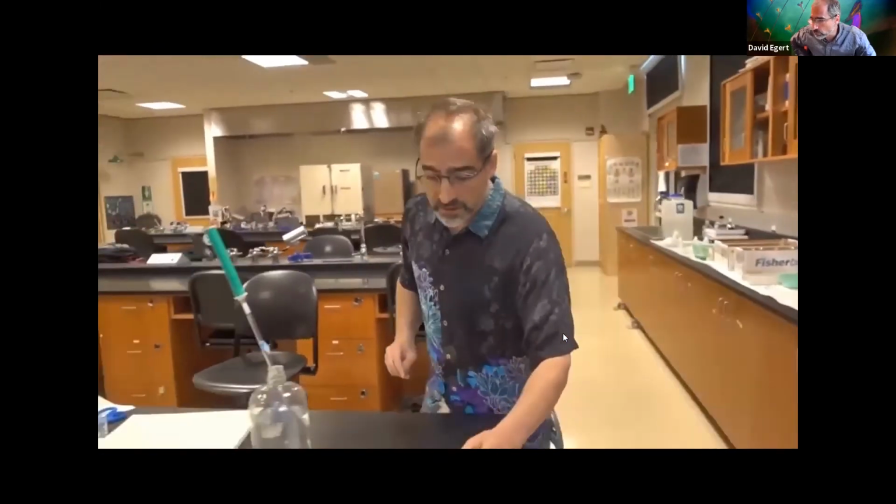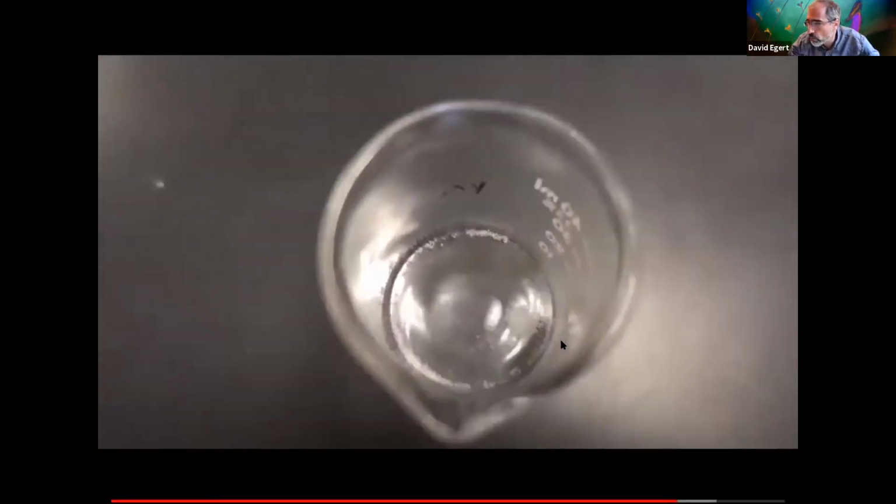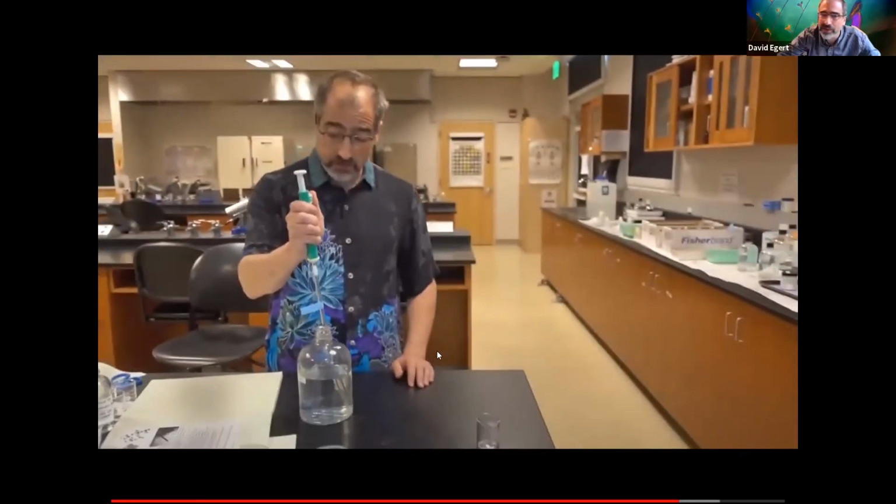And again, you can take a look and see there are little granulated glucose crystals in there, which again, you would record in your lab notebook. That was really fast, but hopefully you can see. And glucose is not sucrose. The sugar you're putting into your coffee, that's sucrose, which is a disaccharide, which we're going to talk about in more detail on Thursday, but it looks pretty similar.